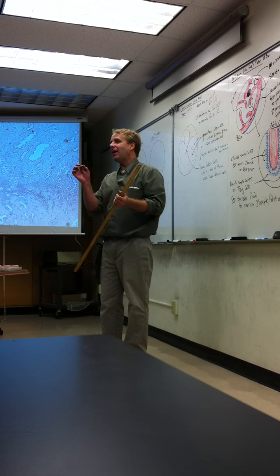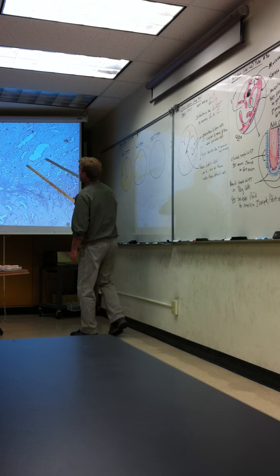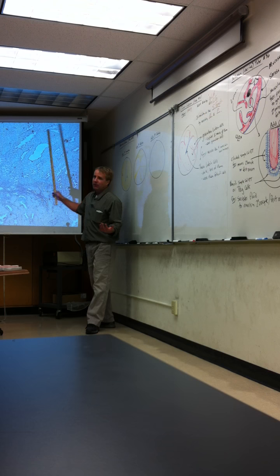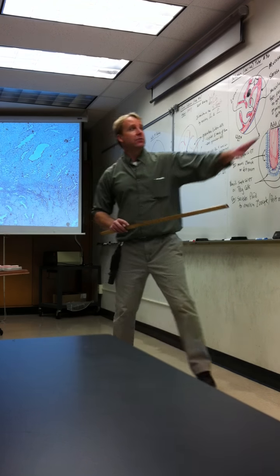Since we're not looking at the other phases, proliferative phase and some of the other ones, I don't think it's fair to make you know secretory phase when you're not recognizing the other phases. And so therefore I won't hold you to know that one. But you need to know just what I have up here.